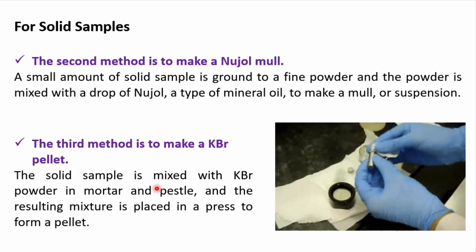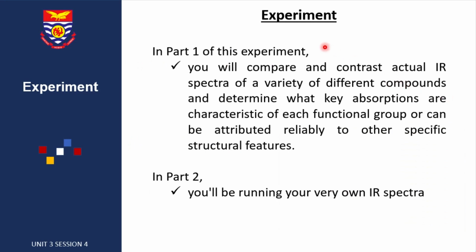Also, your sample is mixed with potassium bromide and then crushed in a mortar and pestle, and then placed in the form of a pellet to be run by the instrument, right?